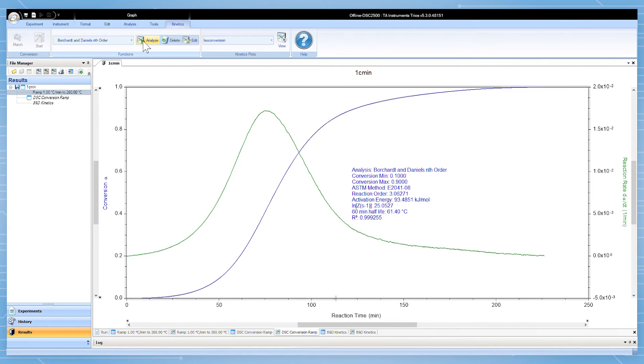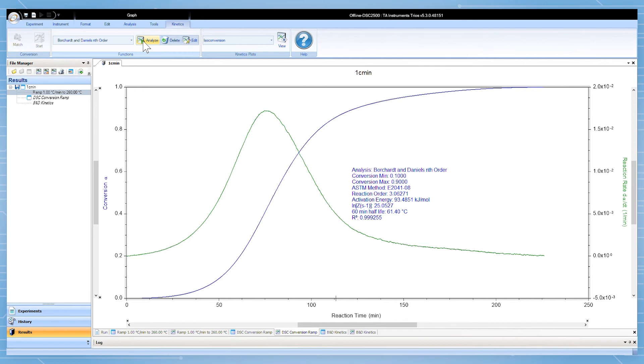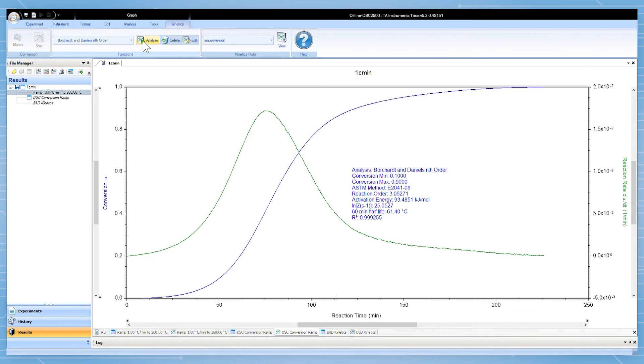For this model these include the activation energy, reaction order, pre-exponential factor, and 60 minute half-life. The reported parameters can be customized like any other TRIOS analysis function by right-clicking on the analysis and going to edit analysis and labels.